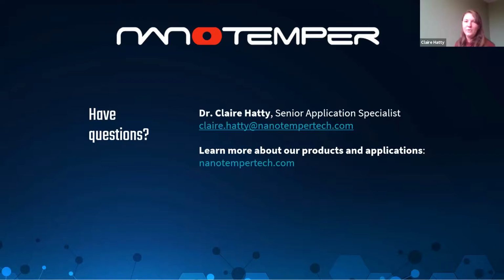Yes, definitely. I didn't actually show it today, but yes, you can set up a competition assay. You can set up ternary interactions very easily. It would be a matter of first establishing the interaction between, say, your natural ligand and your target. And then you would add the natural ligand at a fixed, saturating concentration, and then you can titrate in the other compound and see what the EC50 is essentially.